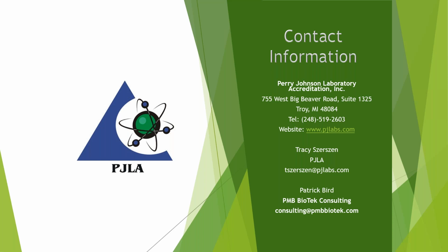When I work with labs, I usually recommend, as general verification guidance, spiking something around 30 CFUs to 50 CFUs for a qualitative detection. So if you are looking at Salmonella, STEC, maybe Listeria in certain instances where a presence absence result is required, you want to take your sample, homogenize it in the enrichment buffer you're going to test, and then spike it at a level that's reasonably low.